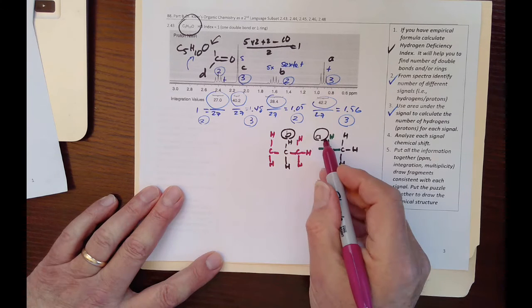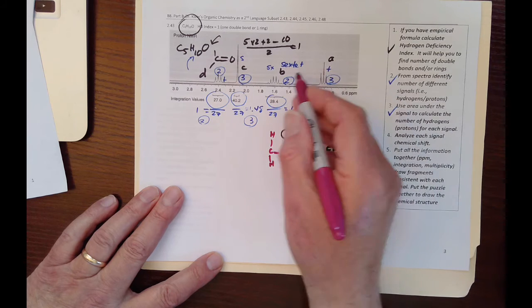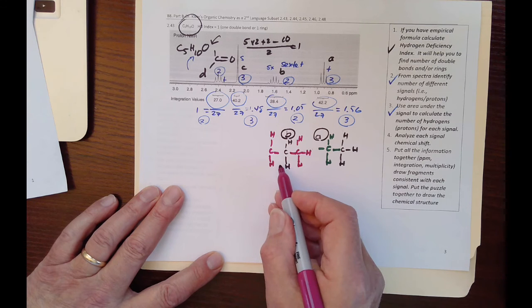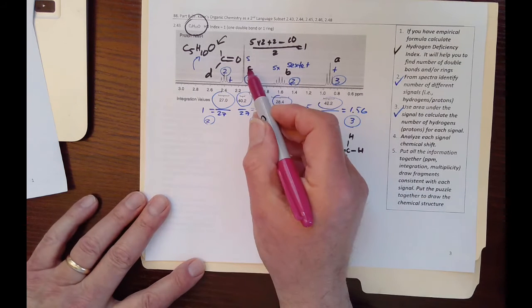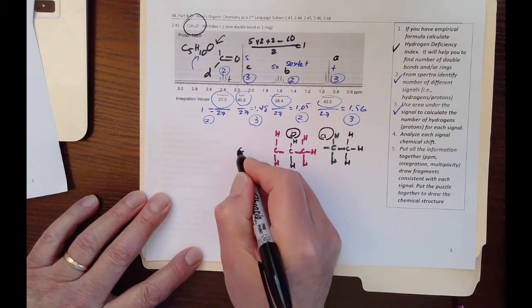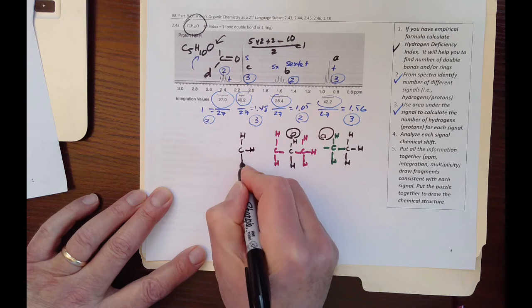So we talk about A and B. The B, these 2 hydrogen, which we calculated, sees 5 hydrogen next to it, so it becomes a sextet. So let's look at the C now. C is only a singlet. That means C doesn't have any hydrogen next to it, and there are 3 hydrogen there on C, right?